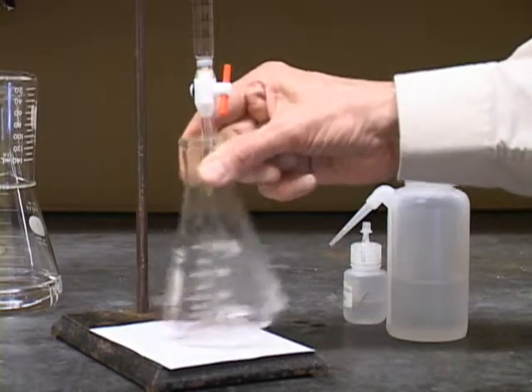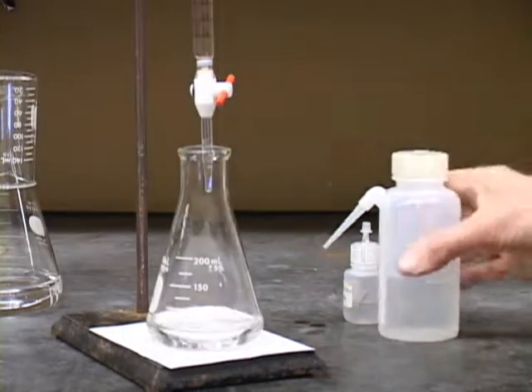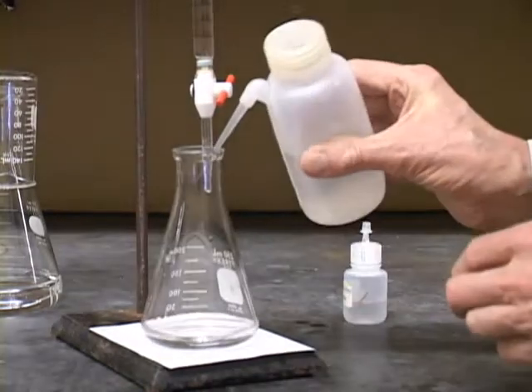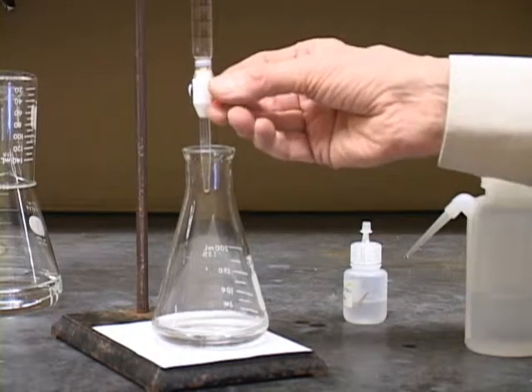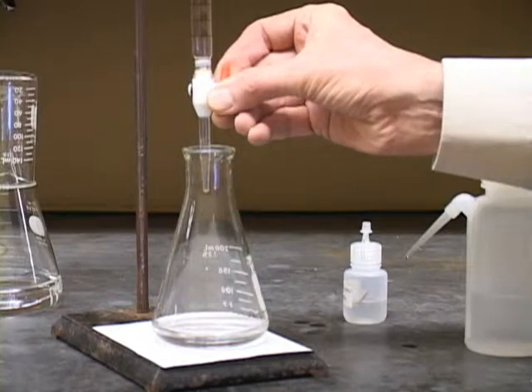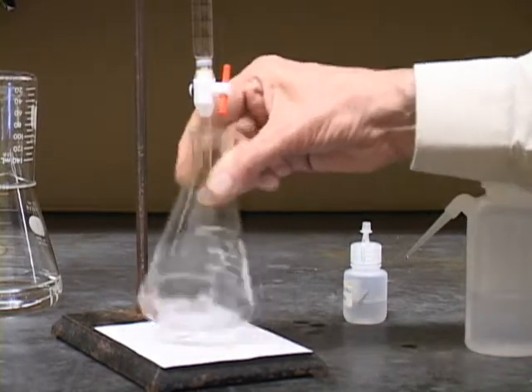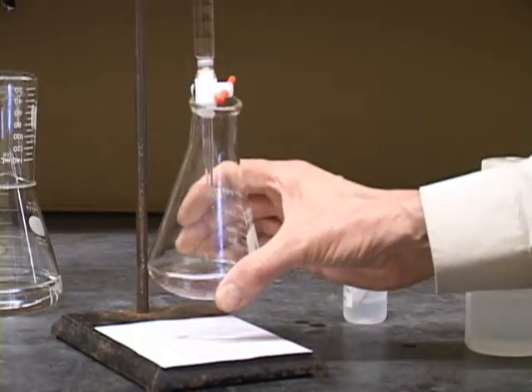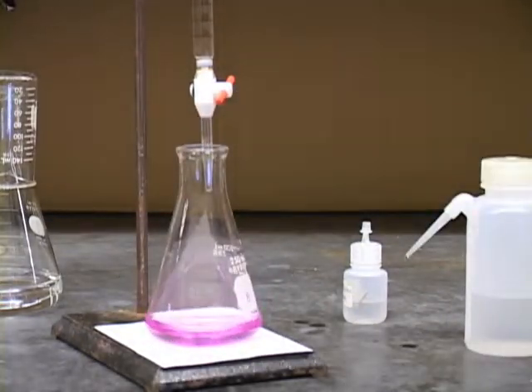Getting there, bigger drops. We're very, very close to the end point, so at this point we will wash down the sides of the flask to make sure that everything is inside the flask and getting titrated. And finally we'll add another drop or 2. Drop. Okay, it's 1 drop, 4, and with that little drop hanging, we'll put it on the side, and that's the end point.